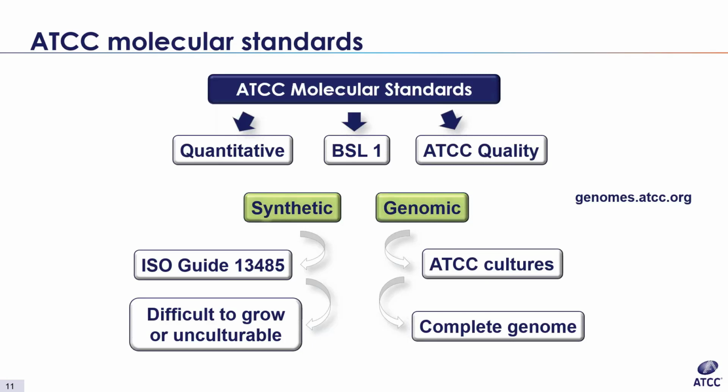And just quickly before I move on, some of the basic applications for these standards are to generate a standard curve for qPCR to determine bacterial, viral, fungal, or protist load, as a control for molecular diagnostic assay development, verification, and validation, to monitor assay to assay and lot to lot variations, and to assign a genome copy number to secondary calibrators, for example, to establish a ratio of plaque forming or colony forming units to genome copies.